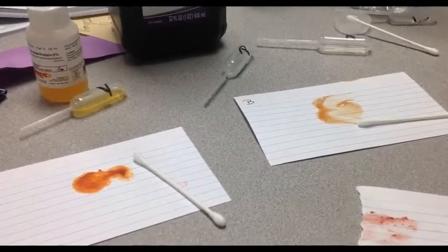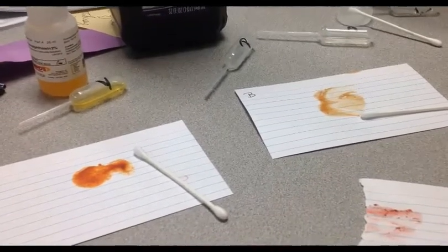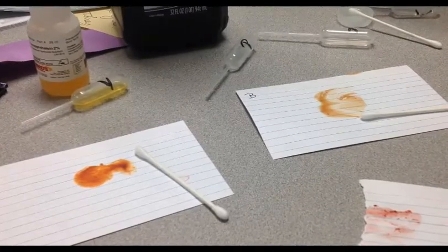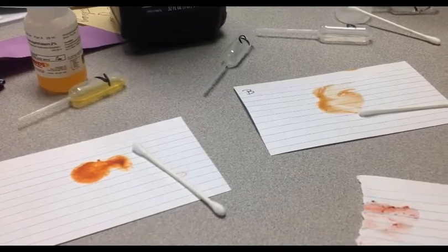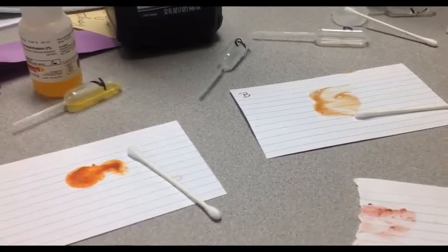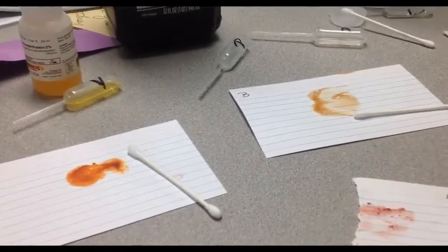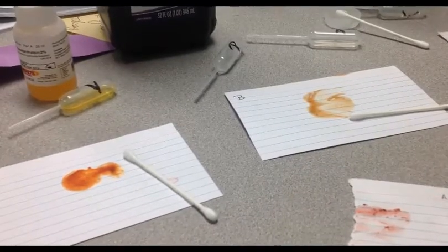When you have hydrogen peroxide and the combination of it with the phenolphthalein and the iron released in the hemoglobin from the alcohol breaking the cell, you have a pretty bright pink or purple color that is presented. That gives you a positive test for blood.